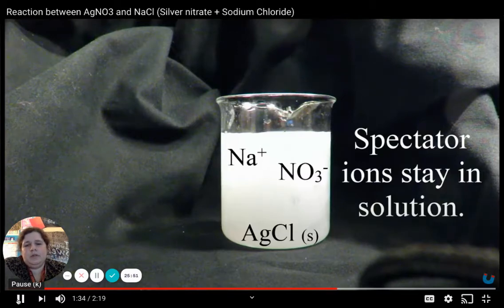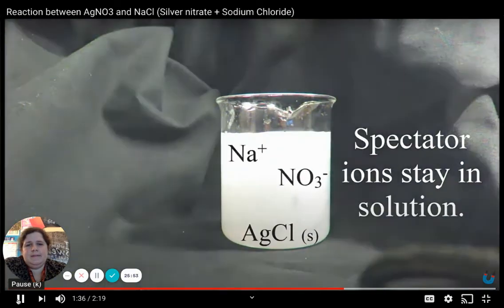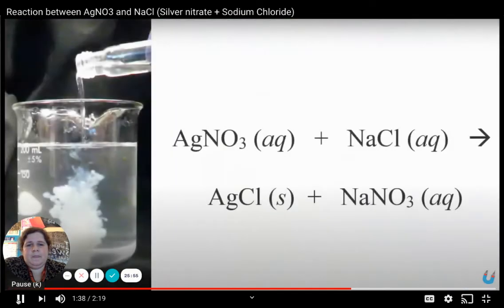So our chemical reaction took place there. And that chemical reaction would look like this. We have our AgNO3 and our NaCl both dissolved in water. Okay, so we know they're dissolved in water because they say aq.